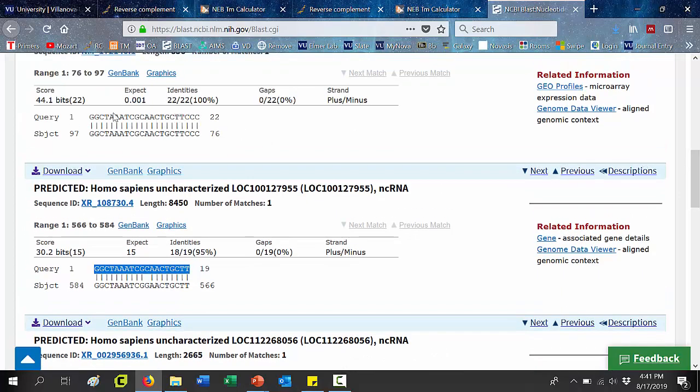All right, so up here we can see that the entire primer binds to my target from 1 to 22. But down here, we only have binding from 1 to 19. So that's relieving, because if the last 3 bases of my primer do not bind to this target, DNA polymerase will do nothing with it. The last bases on the 3' end have to be absolutely complementary. Otherwise, nothing will happen. Your primer might get, let's say, distracted by this other target site that it could bind to, but nothing will come of that. It might bind to it transiently, come back off, and then go bind to its actual intended target.